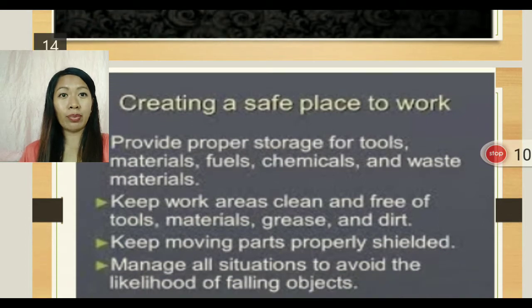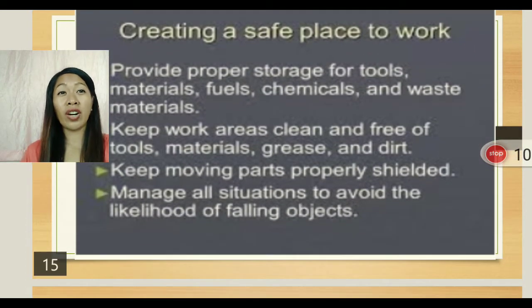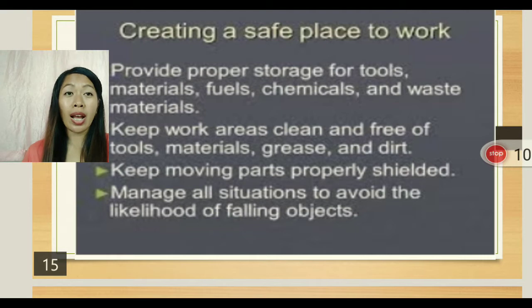For creating a safe place to work, we have to provide proper storage for tools, fuels, chemicals, waste materials. Because if we have the improper storage of these items, then there is a tendency of accidents and mixing up of items.